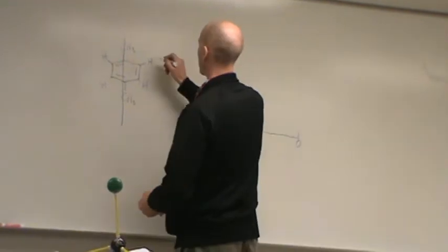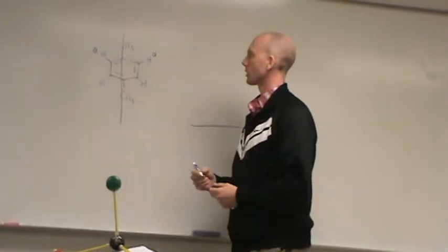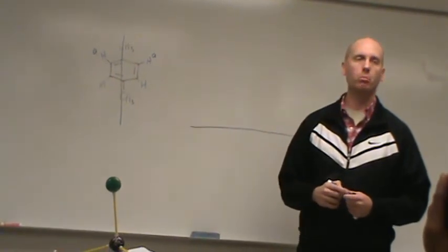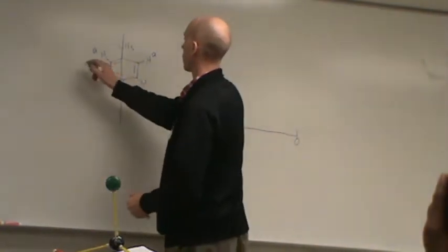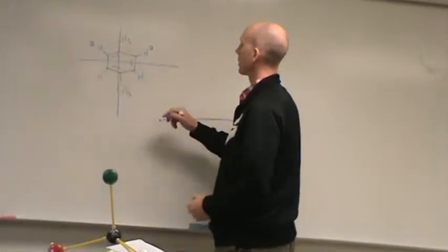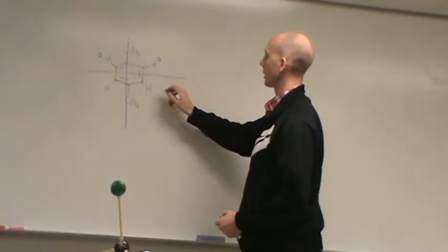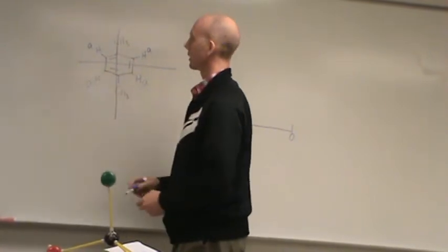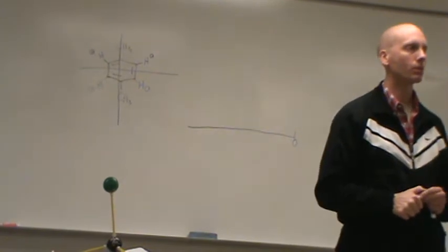Okay, so that makes those hydrogens there the same. Is there any other planes of symmetry? Straight across. So that makes what? These hydrogens the same. And these the same. Okay? So all 4 of those hydrogens are the same.